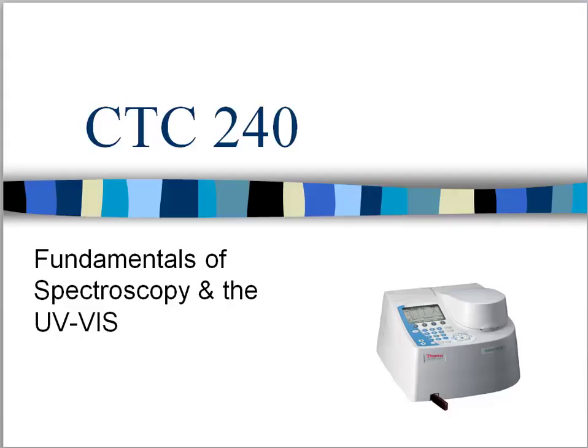Again, we have many different instruments in the laboratory. Those instruments look at different pieces of the electromagnetic spectrum, but for the UV vis portion, which is what you're watching now or what you're trying to prepare for a competition, we only focus on these two pieces of the spectrum, and that is it.